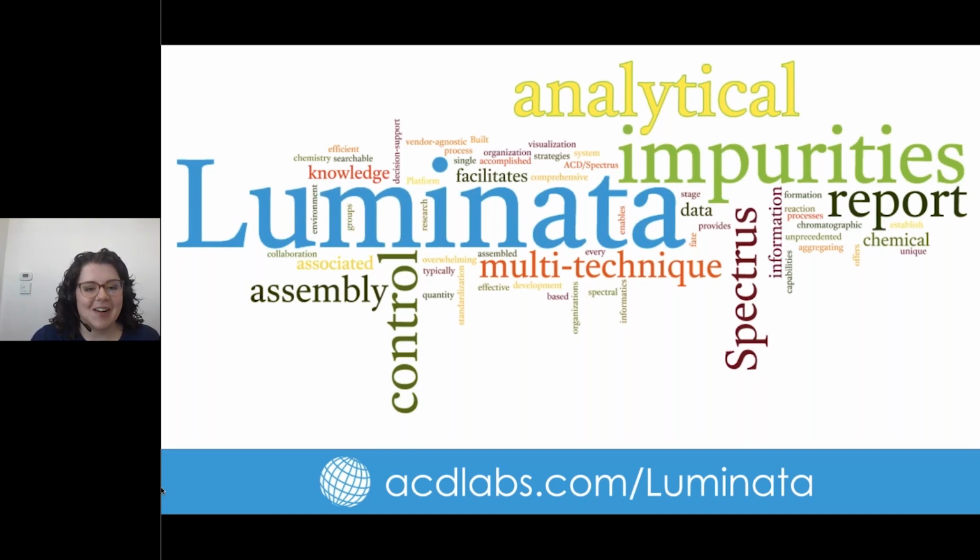Okay. We have another one here. Can Luminata expect the degradants production depending on different temperatures and different humidity conditions? So expect, I guess, is the part I'm not sure about.